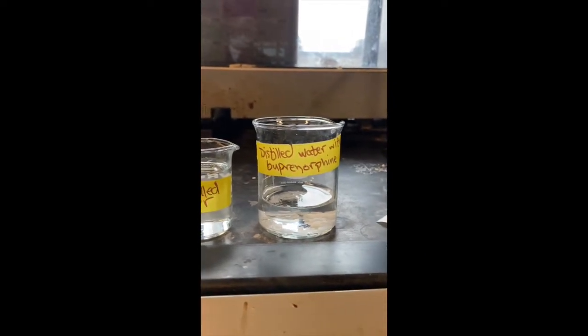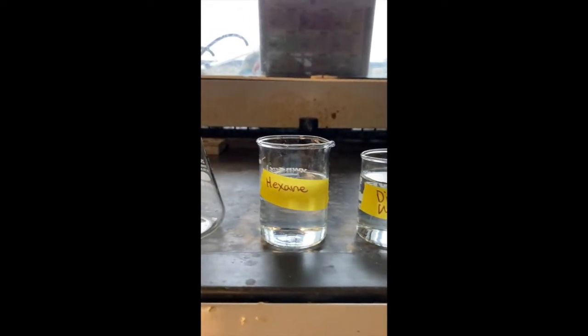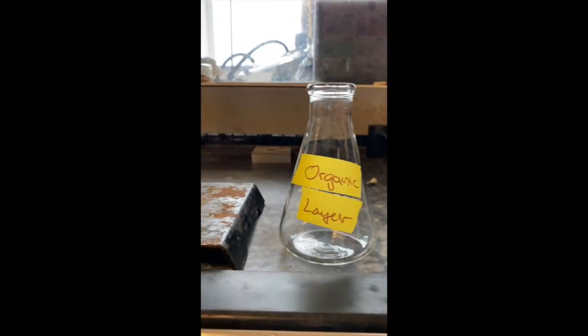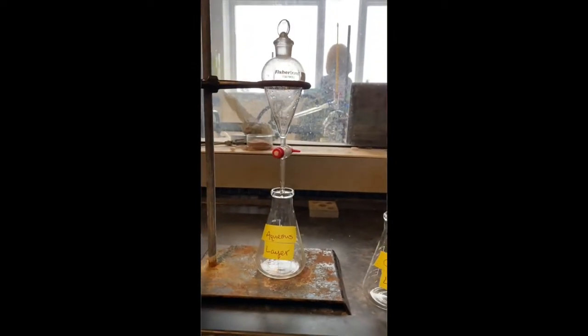To start, as you can see here, I have labeled all of my beakers and flasks. This is an extremely important step that helps ensure nothing is mixed up or contaminated with another substance. You want to always make sure that you do this.